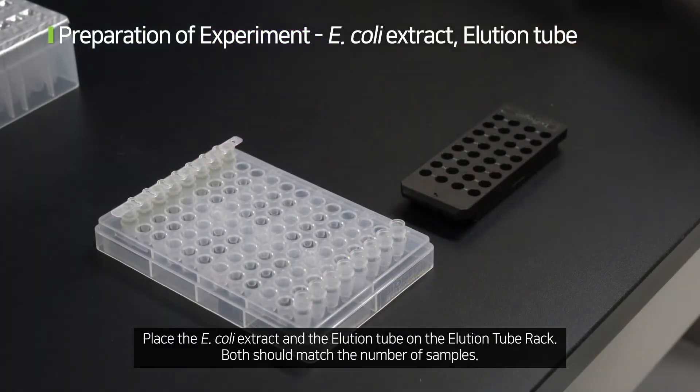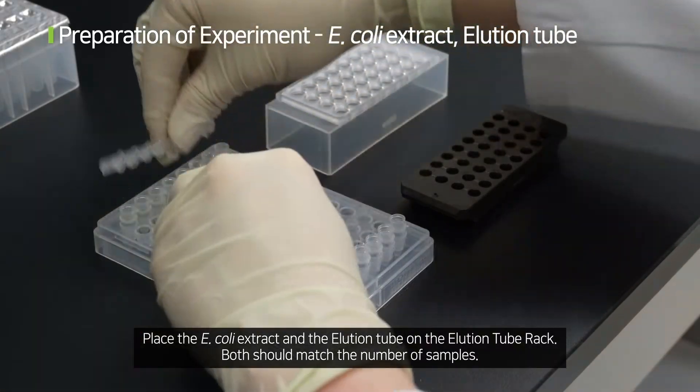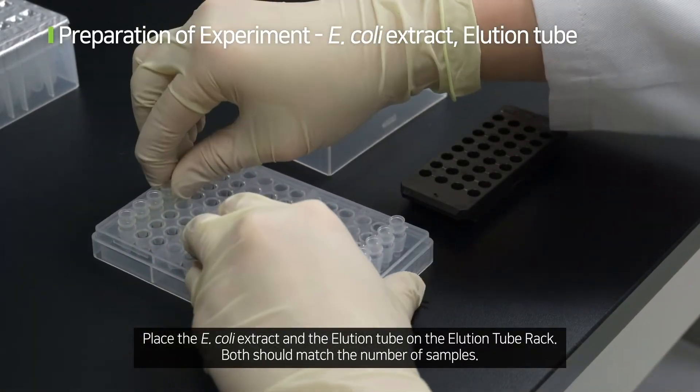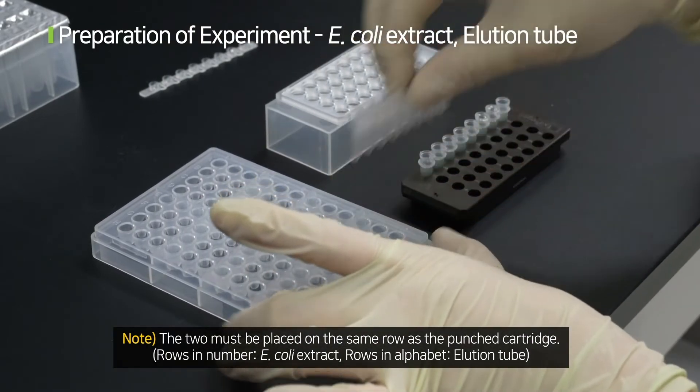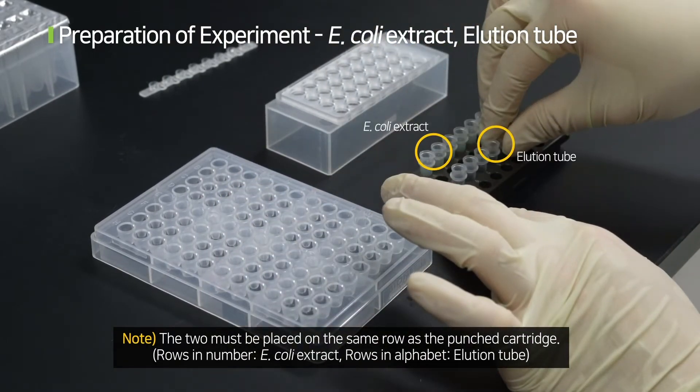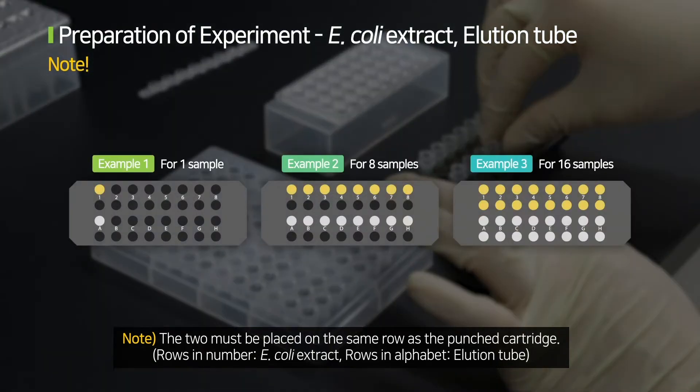Place the E. coli extract and the elution tube on the elution tube rack. Both should match the number of samples. The two must be placed on the same row as the punched cartridge. Rows in number correspond to E. coli extract; rows in alphabet correspond to elution tubes.